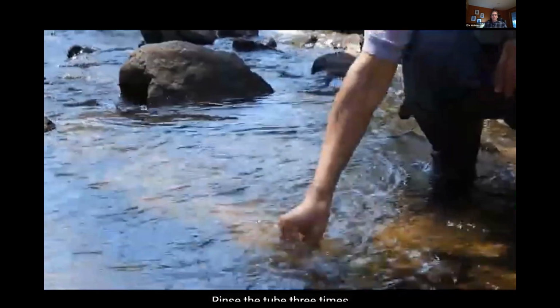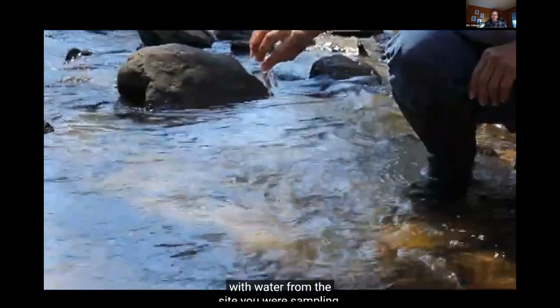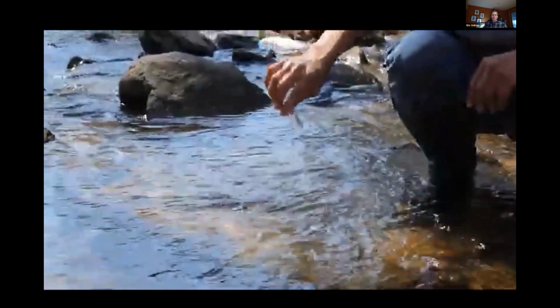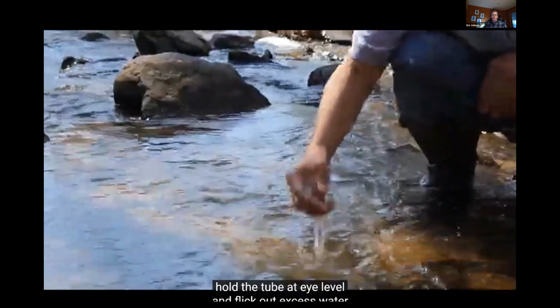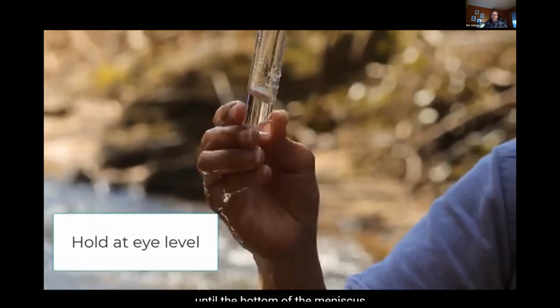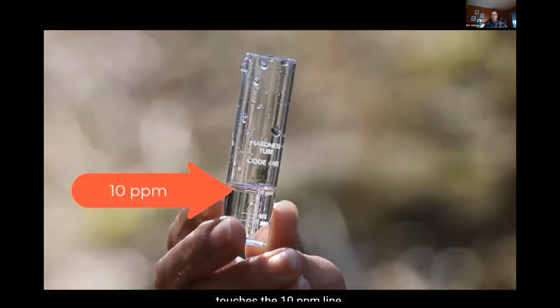Rinse the tube 3 times with water from the site you are sampling. Fill the tube with sample water. Hold the tube at eye level and flick out excess water until the bottom of the meniscus touches the 10 ppm line. This is your 10 parts per million, or ppm, sample.